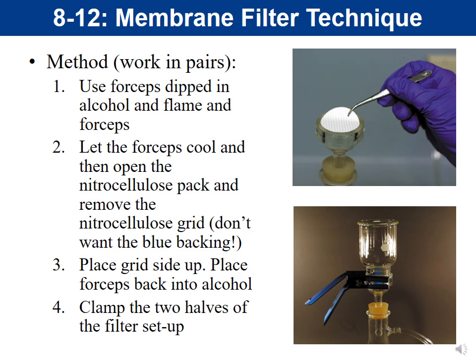If you wanted to see this, you can go on YouTube and Google flash paper. And you can see that when you light nitrocellulose on fire, it basically disintegrates very quickly. And so when you're doing this experiment, you have to make sure that your forceps are not too hot, because if so, the nitrocellulose will go up in flames. And so you would have to let your forceps cool. Then you would open the package for the sterile nitrocellulose.